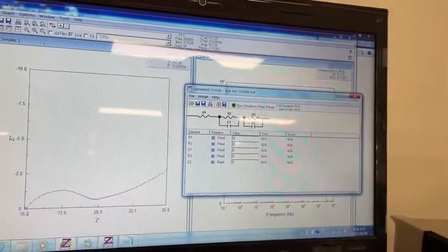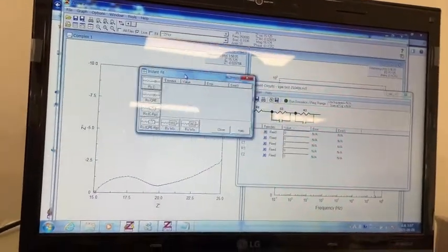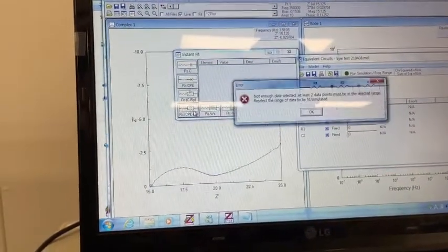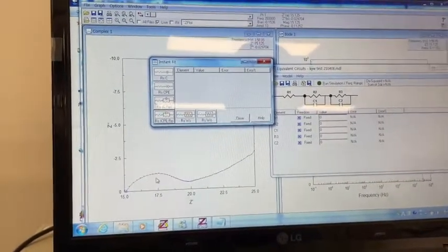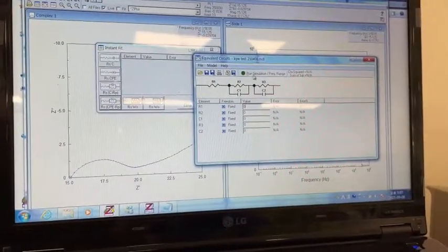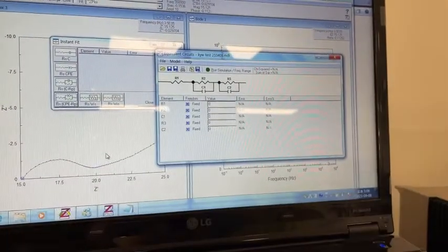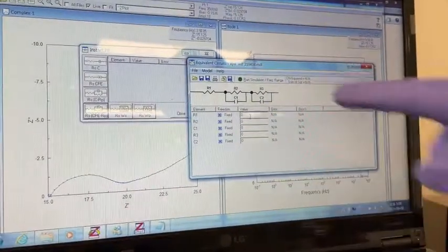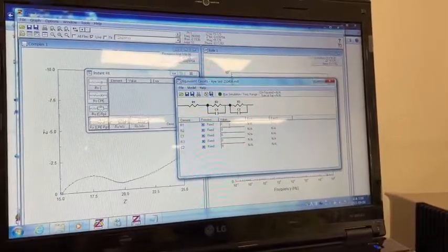Okay, so you can select many other parameters depending upon your sample, so you can drag and plot whichever parameter is applicable to your sample. But I think for this particular geometry, your equivalent circuit could be of this kind, and maybe you can run a kind of simulation depending upon this plot. So if you fit this value, you can get the correct values of all these parameters corresponding to this. Okay. That's all for the EIS measurement.